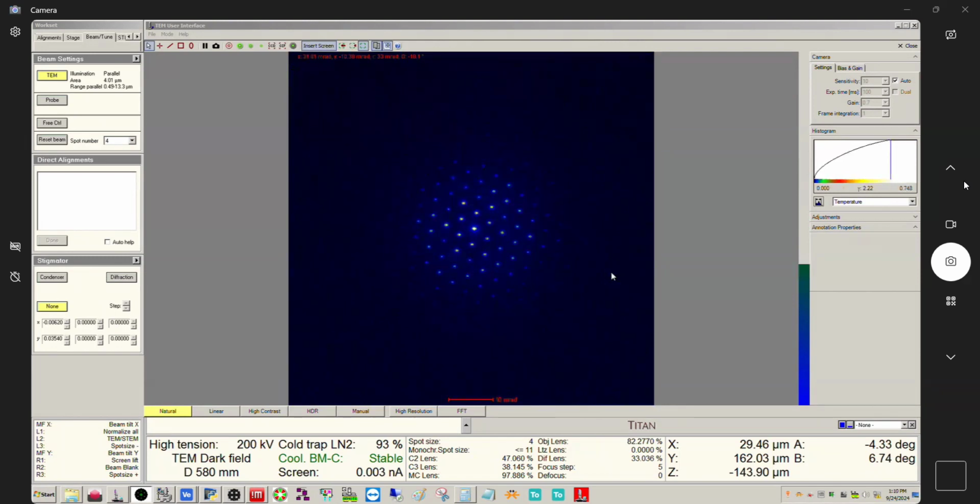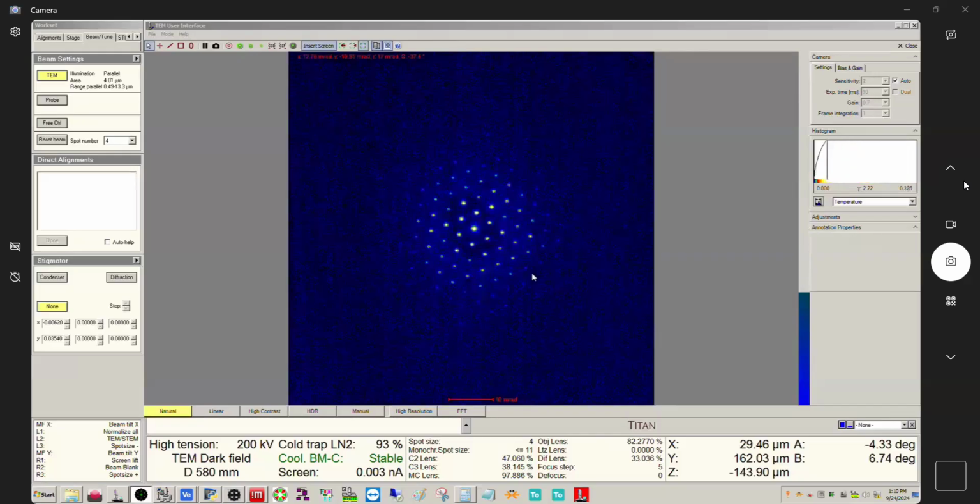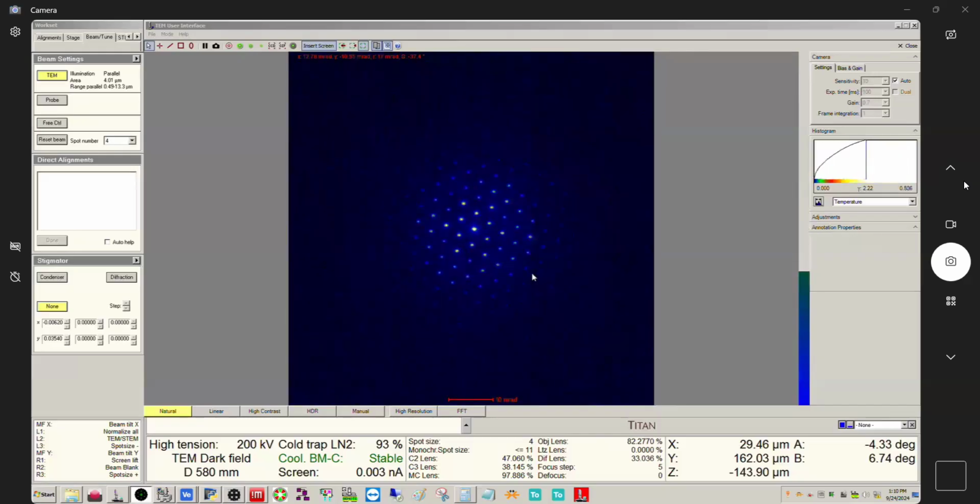All right, so there we go. So now again, when we're at 3 picoamps, our signal to noise is not great here. So seeing the asymmetry is going to be a little tougher to do than if we had higher current. But again, the goal here is safety. We're trying to be safe. Okay, that looks pretty good to me.